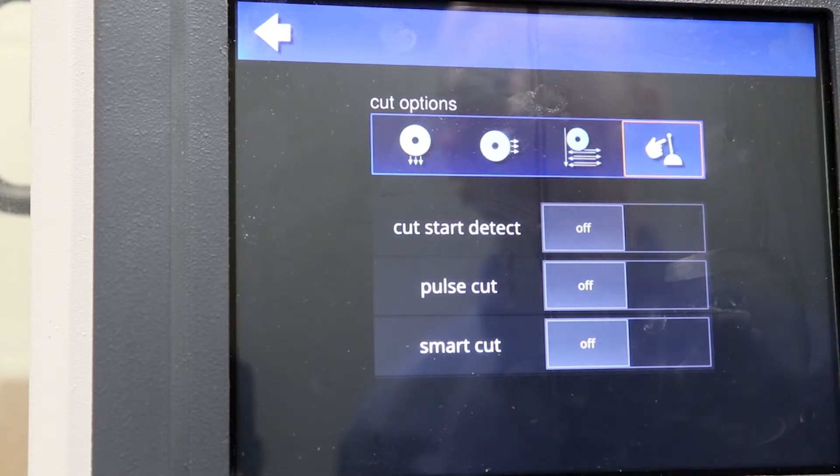We also have a manual mode. The user can select to operate the saw manually using the joystick if they choose.